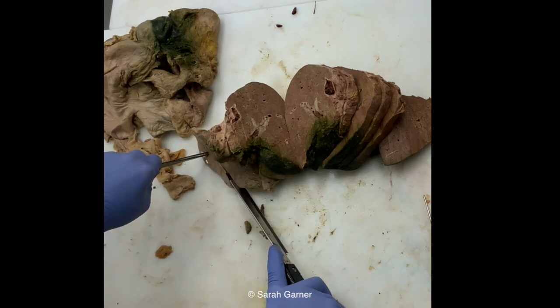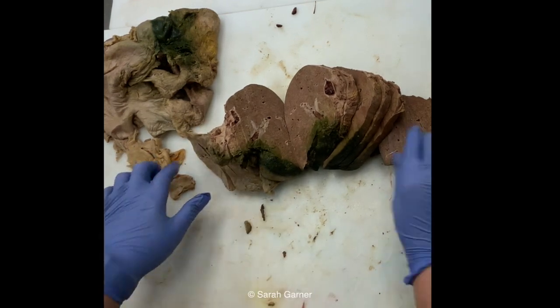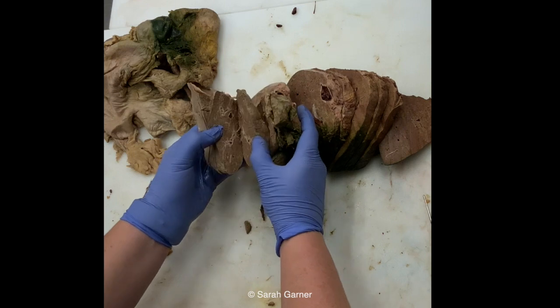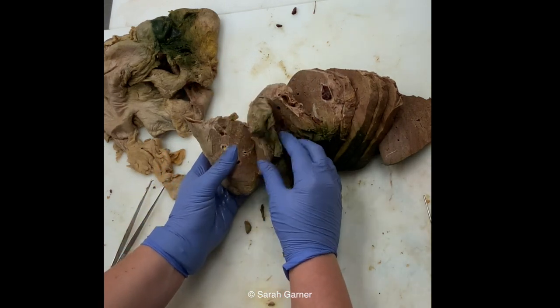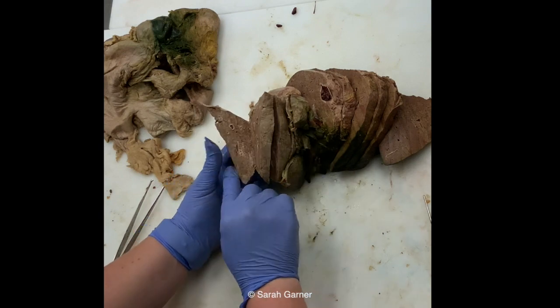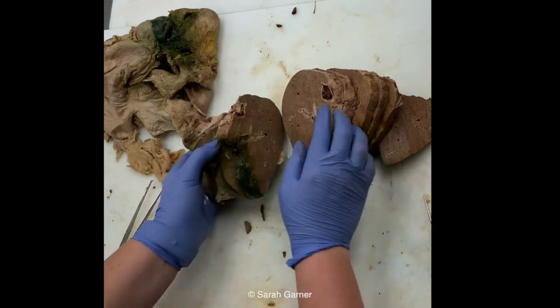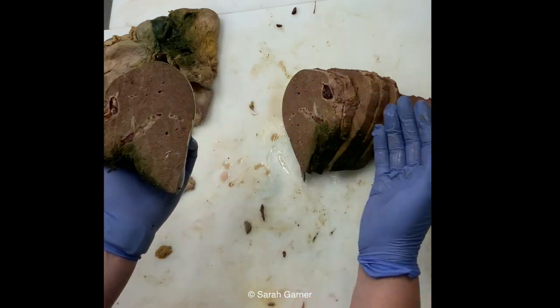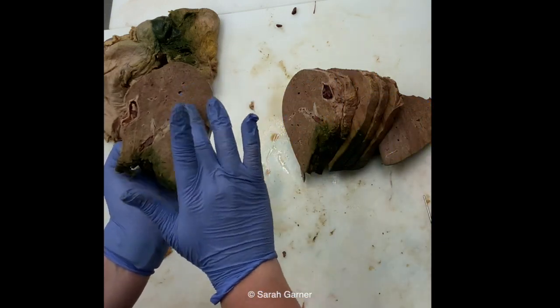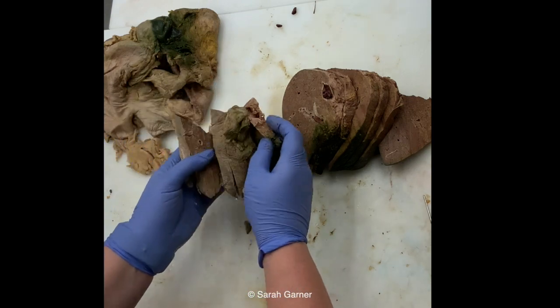But I feel like also at autopsy, a lot of the times you'll cut things a little bit thicker than you would. Well, definitely you cut things a little bit thicker than you would at surge path. So basically you're looking at the cut surface. This does actually look a little bit congested. Now, since it's fixed, it's hard to tell, is that part of the fixation or is that actual congestion? But it does have kind of a congested cut surface.